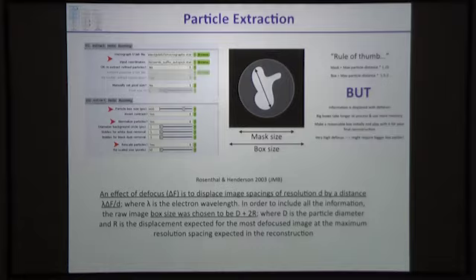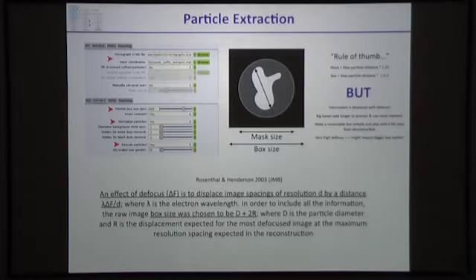So box them and make a new image, extracting this small part of the image into a new file. And you can do this easily within RELION. The thing that you need to be aware of is the size of the mask that you're using, and of the box that you're using, and the mask for normalization. To decide what the mask size is, or should be, you should be aware of what the maximum distance within your particles is, and you can measure this from the micrographs.